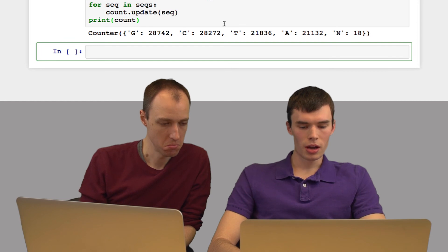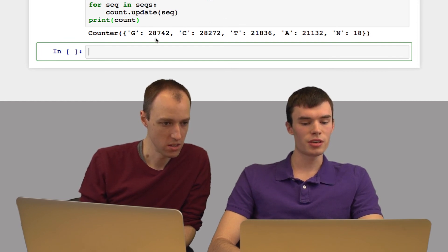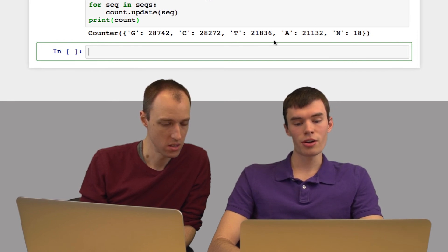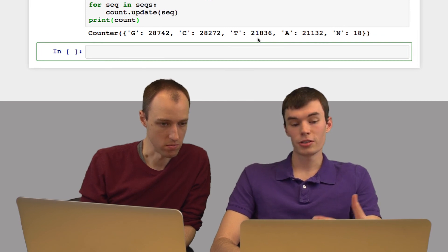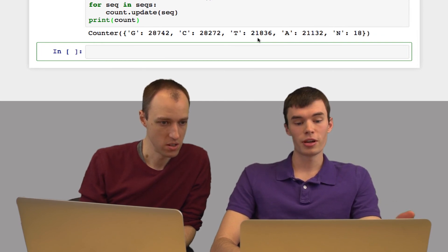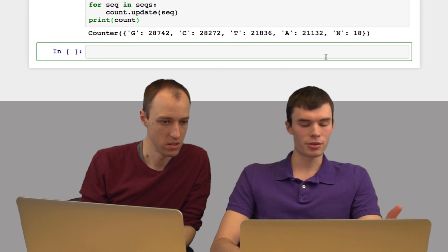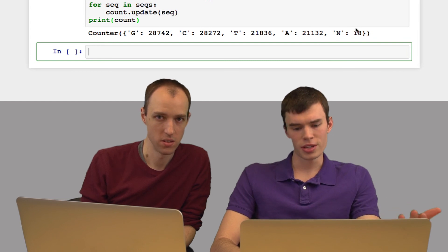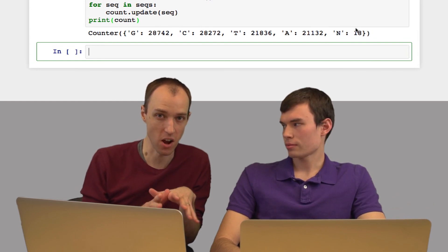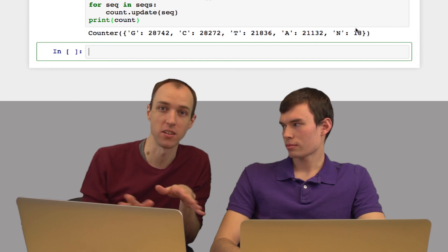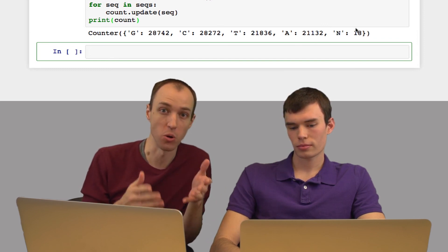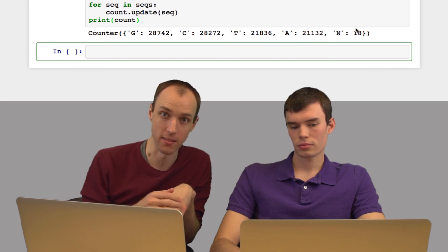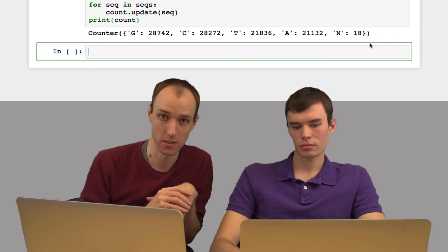As we said above, G and C both occur at least 28,000 times, while T and A only occur between 21,000 and 22,000 times. So GC content is above 0.5 in this organism. Something interesting is this N, which is not a base. What is that? N is when the base caller has no confidence. It doesn't want to make a call because there's no good evidence to support one base over the others. You can think of N as meaning no confidence.